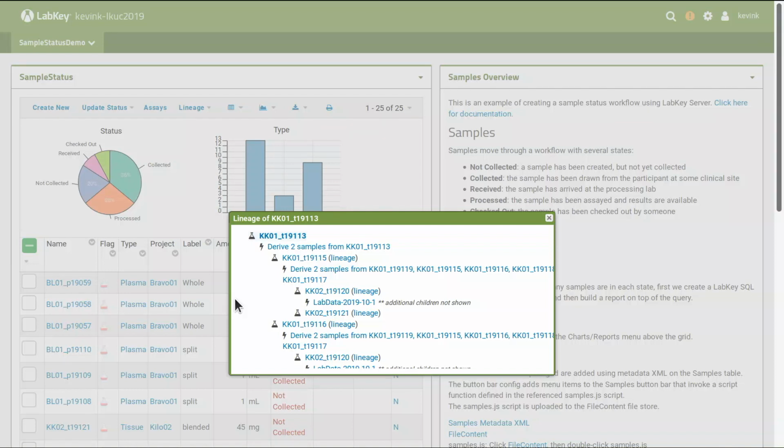Like we have all the way to the end, all the tuning clones, and we want to know parents of parents. But we have 8 of the tuning clones. Right. So the question is, can we access the lineage for more than one sample at a time? It's possible, just not with the current API.